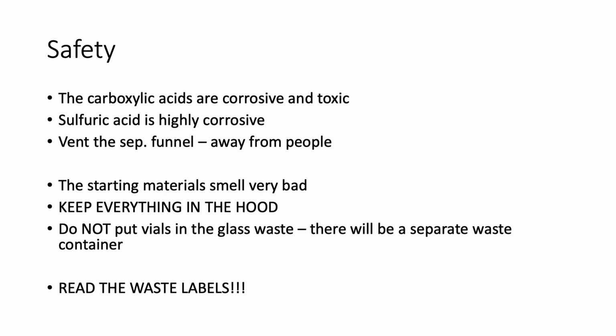And this is key for everybody, regardless of what lab you're doing. So starting on Wednesday and Thursday, we're going to be doing 3 different labs at the same time, and we're going to try to keep the waste containers in the bays with the proper labs that they're associated with. But pay attention to the waste labels. Read the red tag. If you're holding something and you're going to put it in the waste container, take the extra second to make sure it is the right one for the lab that you are doing.